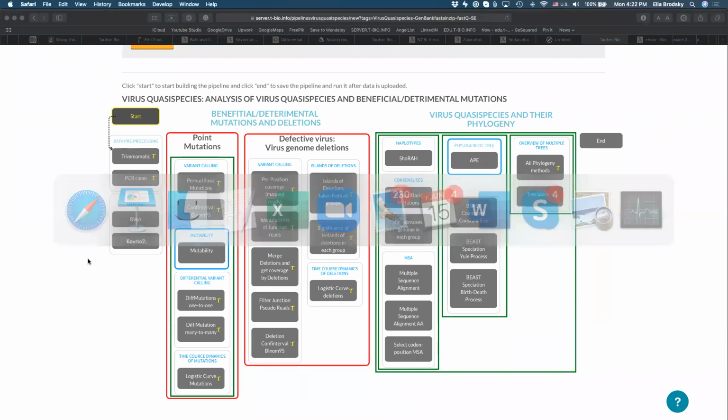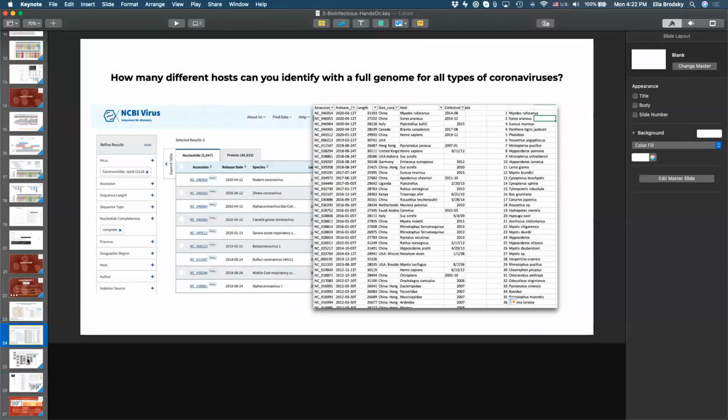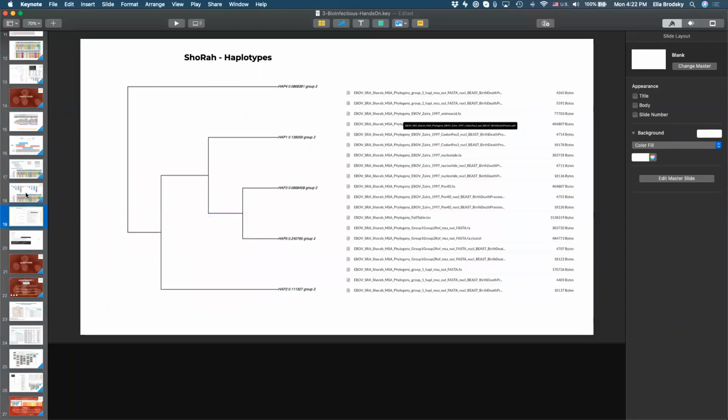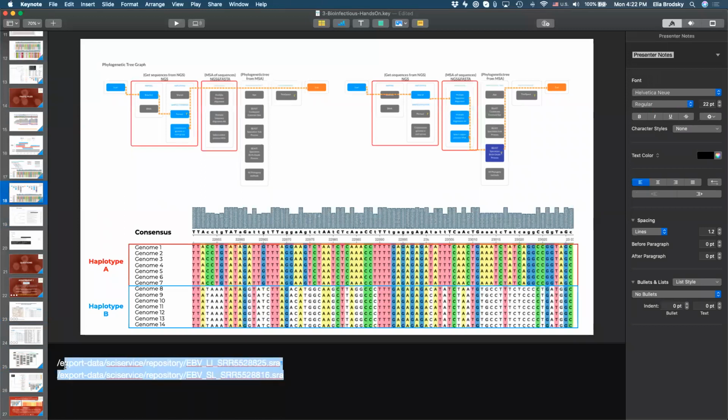So if we think of the other types of sequences that we can use, I want to just give an example, not based on those FASTA files. Sometimes FASTQ files could be fairly large. So I'm just going to paste a couple of links here.